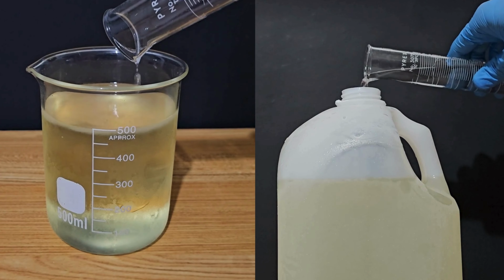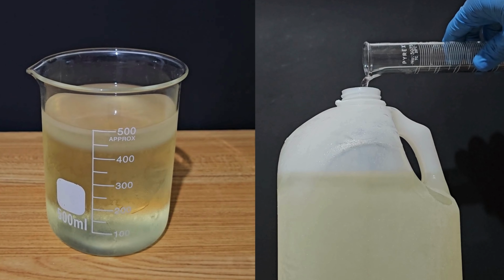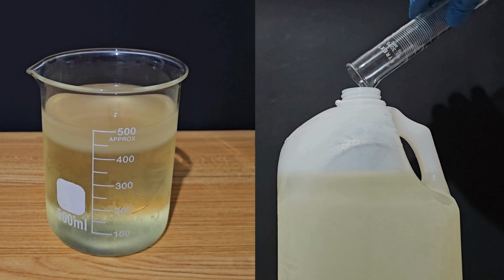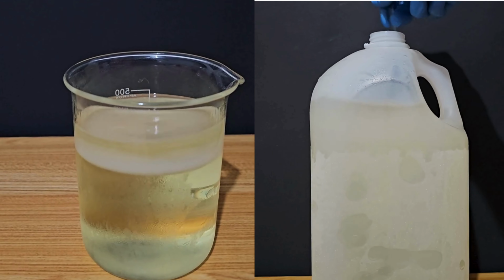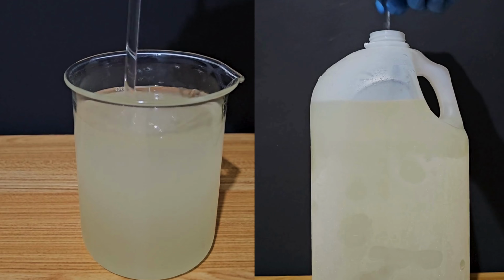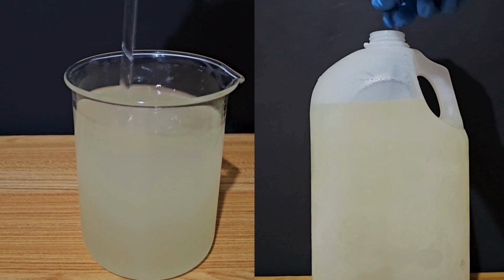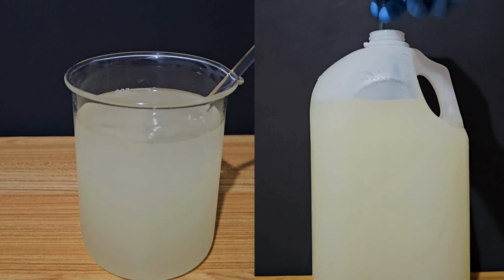In the beaker I added 19 ml of acetone very slowly, and in the bottle the rest of the acetone. I mixed both solutions well using a glass stirring rod. Very soon, cloudiness appeared. While this is reacting, let's discuss what's happening here.